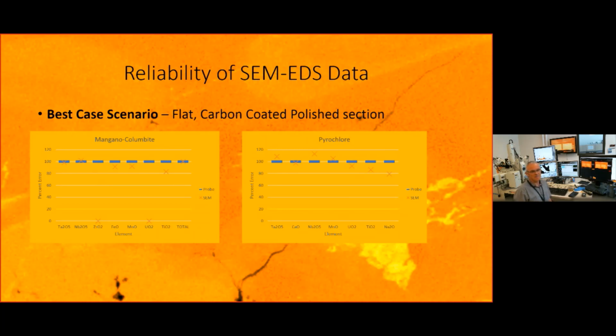And if you don't have a probe, you can actually do quantified analysis on the SEM with standards, and you can get even closer to this. So, you know, SEM data, it's great, and it's a really useful tool. So, okay, why would I want to go to the microprobe then? What's the use case for doing microprobe work?